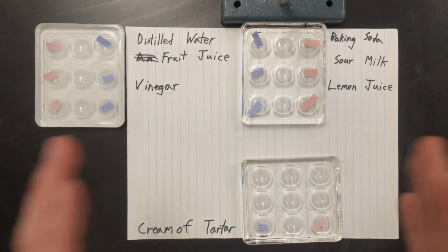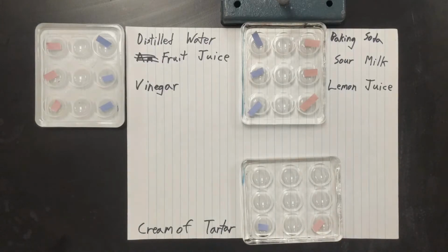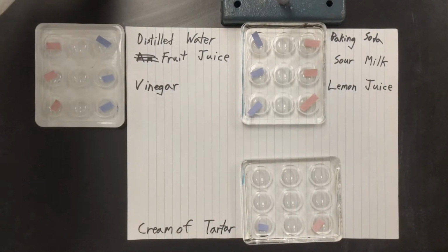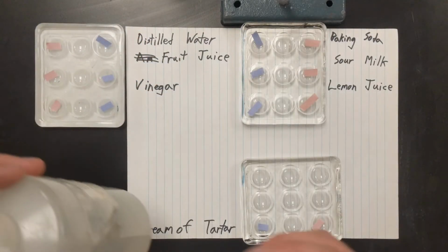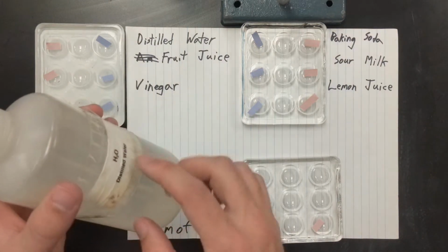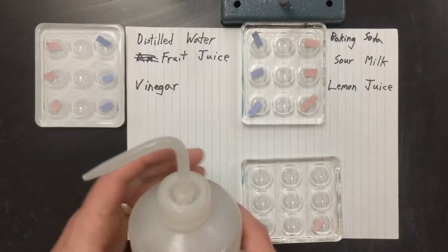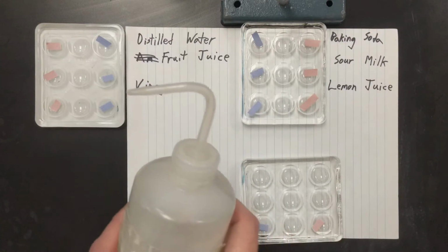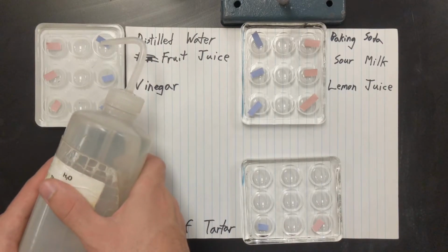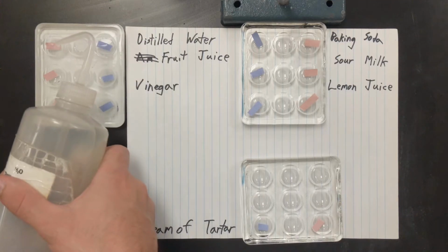Okay, so we now have it all set up. We have a row per chemical. And what we're going to do is just start dropping some water or some vinegar or whatever the chemical is. So first thing we're going to do is start with distilled water. Distilled water often will come in a jug like this in a lab. So you just squeeze and it comes out this little nozzle here. So I'm going to put a little bit of distilled water here, there, a little bit here.